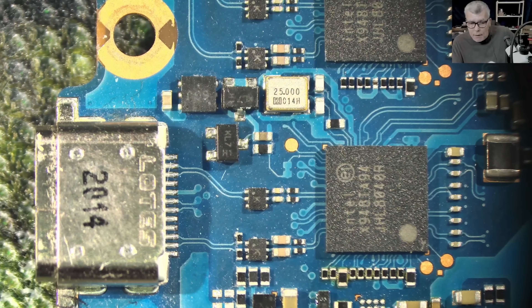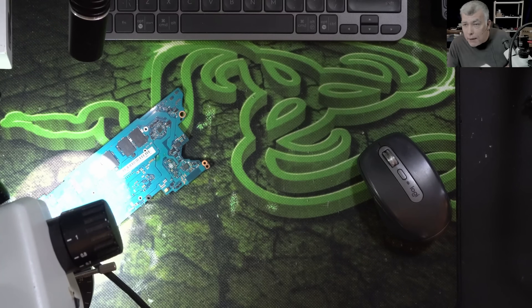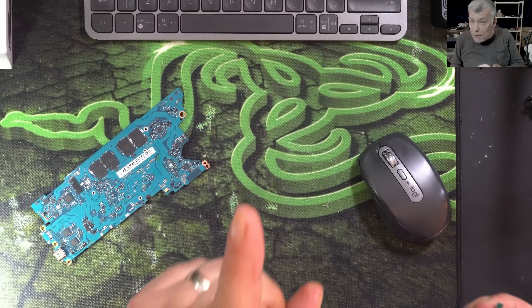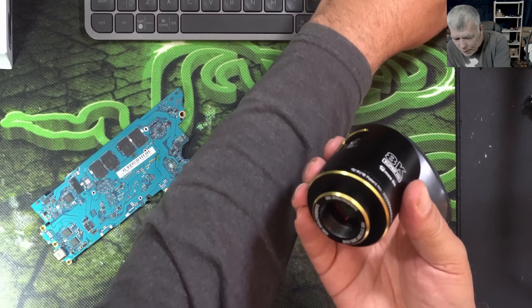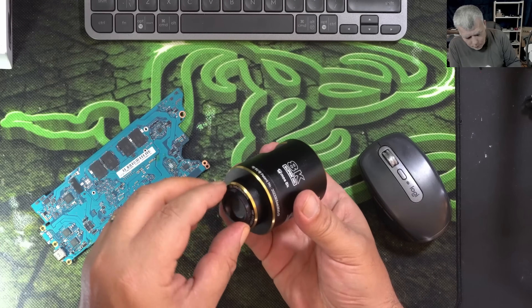My current camera cost 400 pounds — with customs fees probably around 450 — and I bought it in 2023. So for 125 pounds to get this kind of quality two years later is insane. Here's the deal: I've given you the review, so you give me something back — do the research and leave me a comment telling me what mount I should buy so I can properly attach this camera to my microscope.